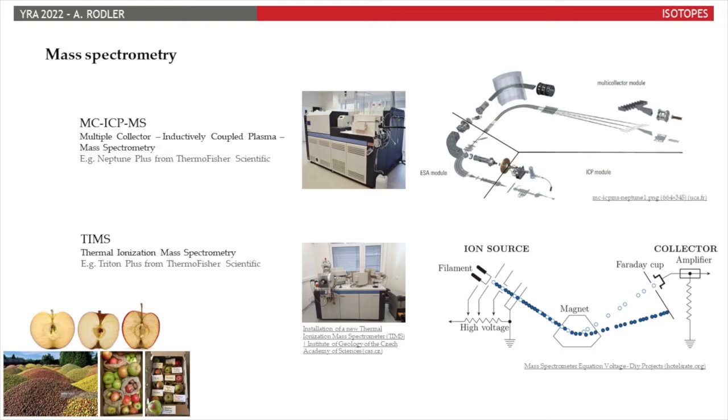And then in this way we isolate, for example, lead, and then the samples go into the source, they're ionized and sent along with an ion beam through a magnet, and this magnet then separates the different masses of isotopes, which are then later collected in ion detectors, and then we can calculate how many of which isotope were sent through and included in this sample.